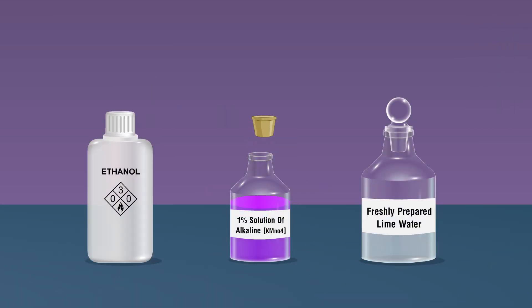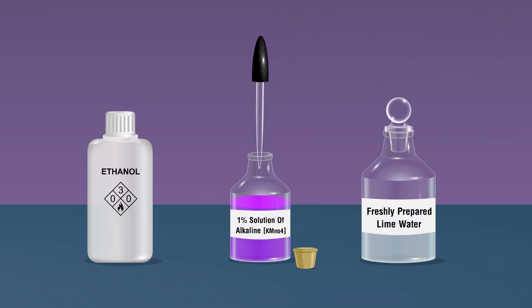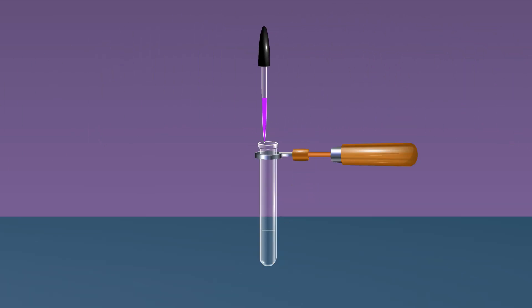Take alkaline KMnO4 solution using a dropper. To the boiling tube, add two or three drops of 1% alkaline KMnO4 solution. The purple color gets decolorized.